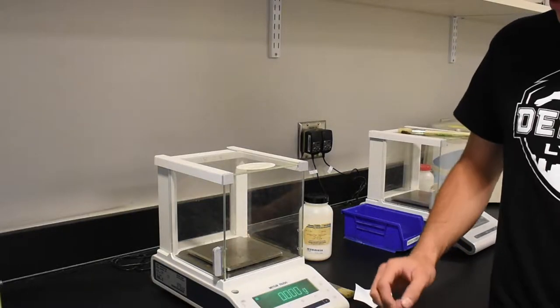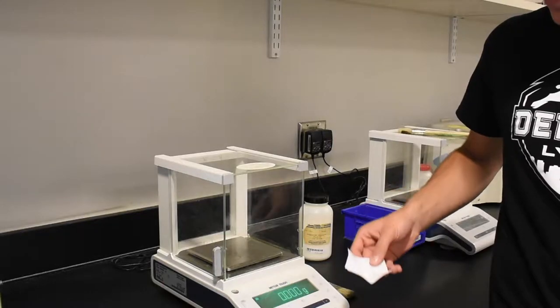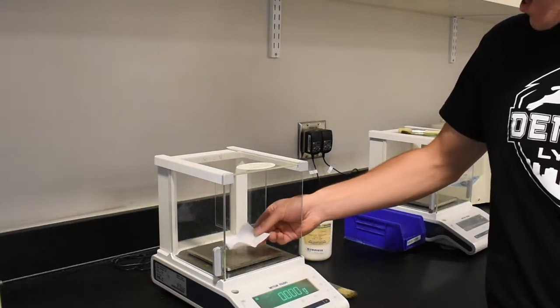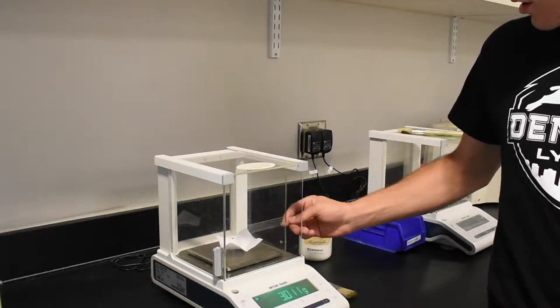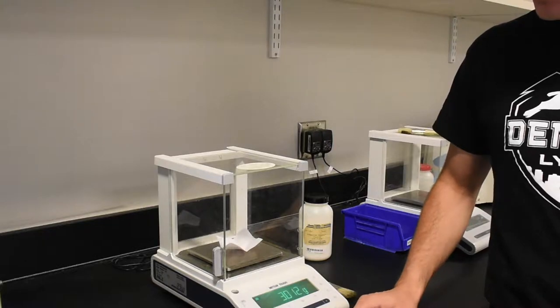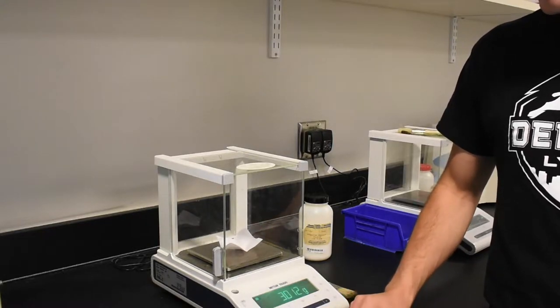Next, place your sample in an appropriate container. Place it on the balance pan. Close the door and wait for the measurement to stabilize, and then record your measurement.